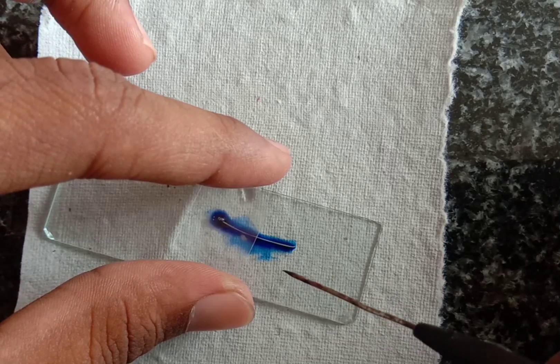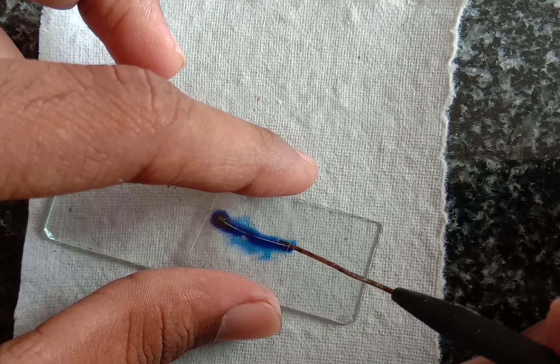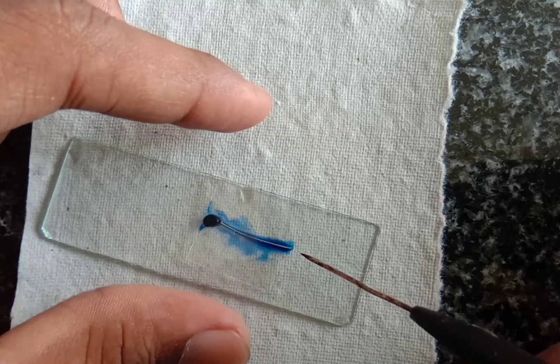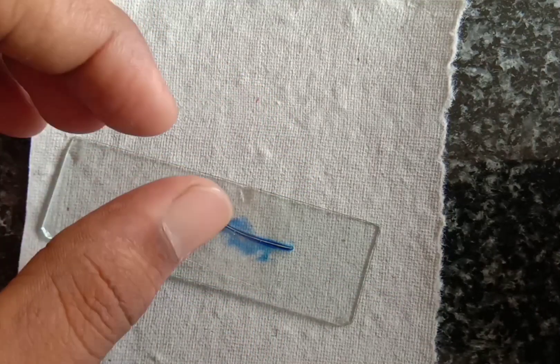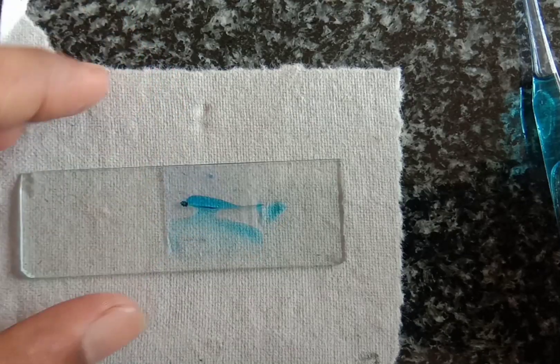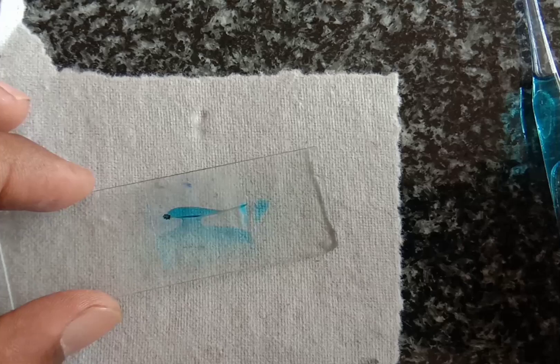Now with the help of a needle, put a cover slip on that like this and gently press the slide. Now you can watch it under the microscope.